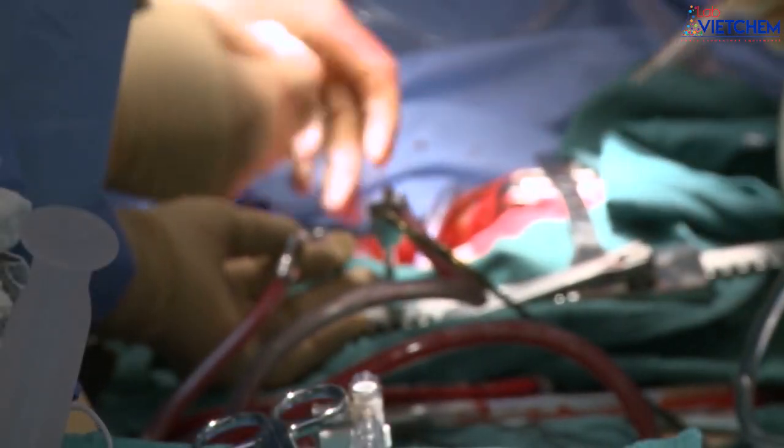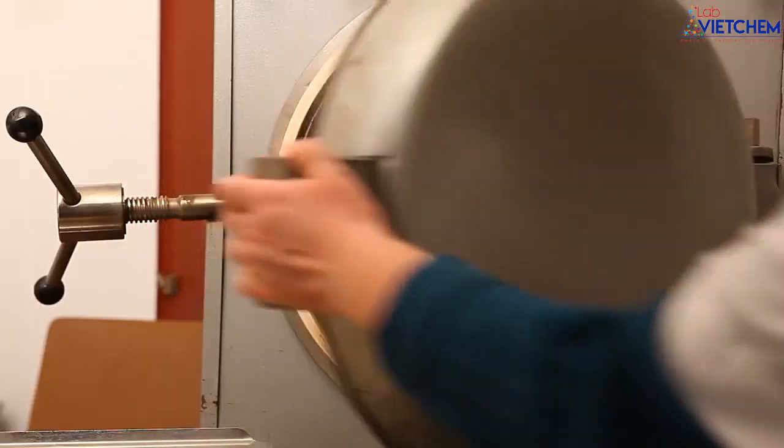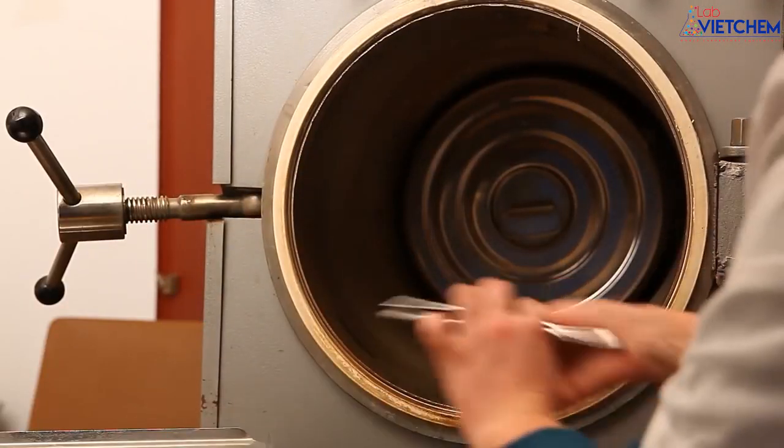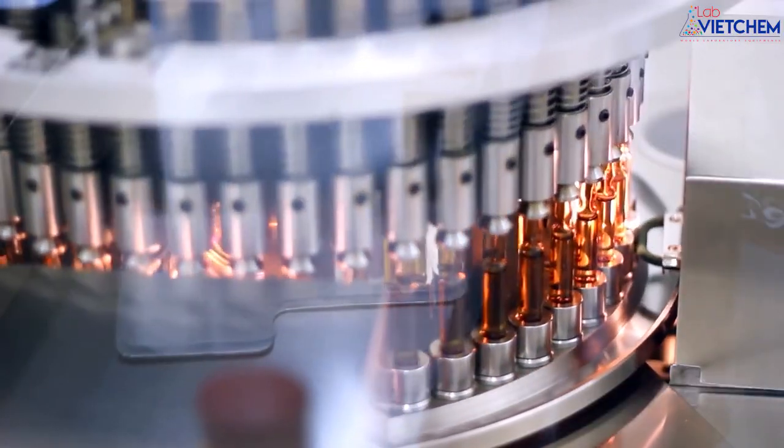Would you want a surgeon to use a scalpel that has bacteria growing on it? Of course not. Surgical instruments must be sterilized. That means no living organisms are present. There are lots of products that need to be sterilized.